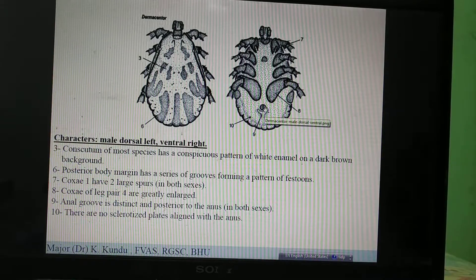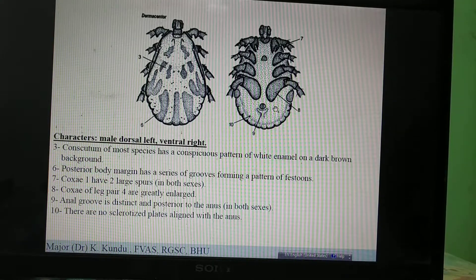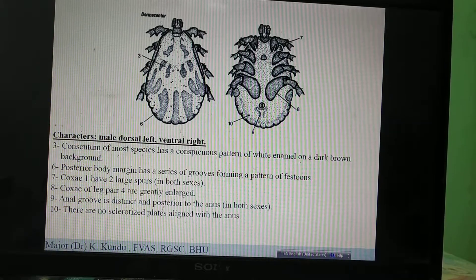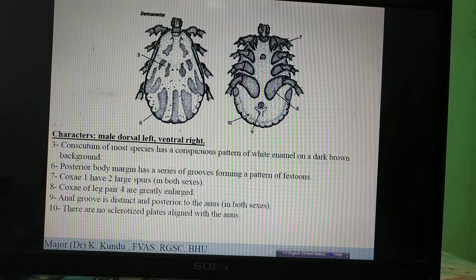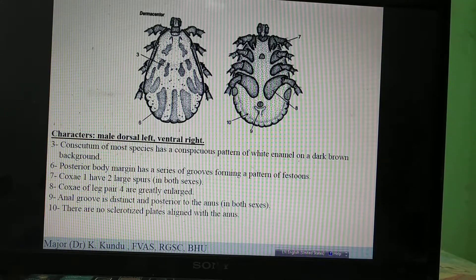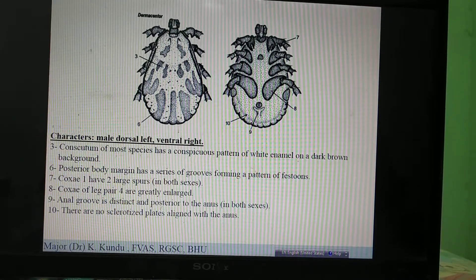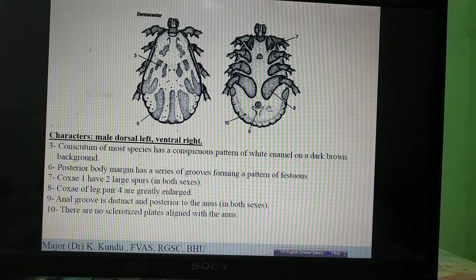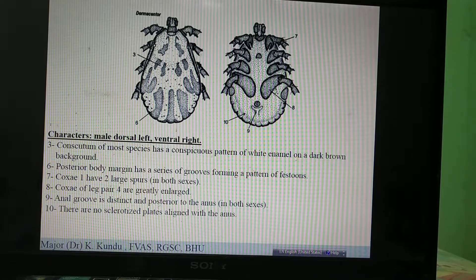In male Hyalomma, distinct sub-anal and adanal plates are present. In Amblyomma, no plates are present but there are small posterior plaques. In Dermacentor, there are no plates as well as no plaques — all plaques and plates are absent. The most distinct feature is the very large fourth coxa.